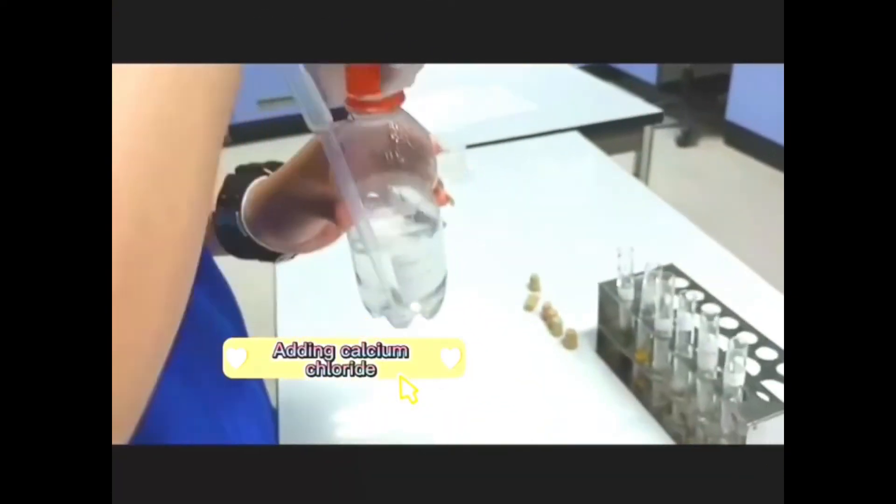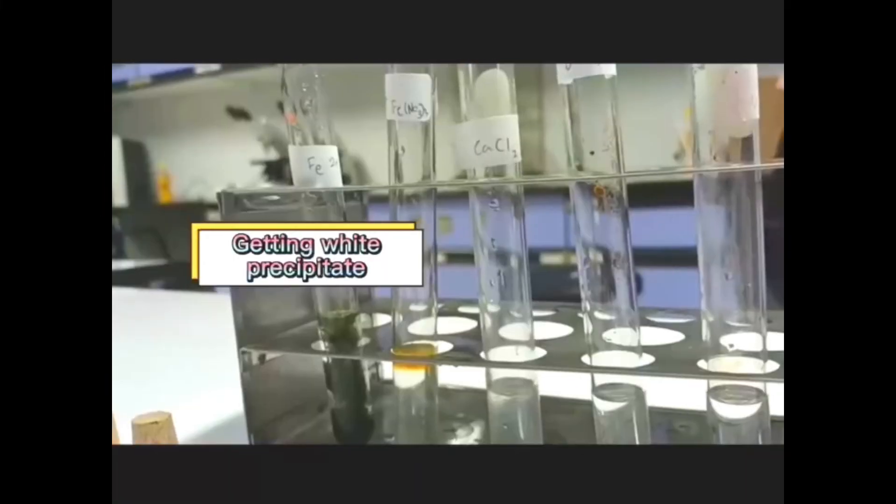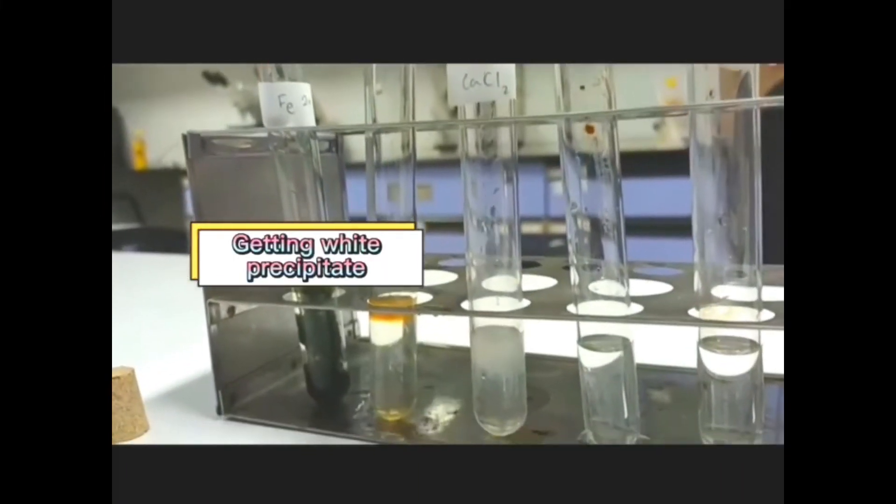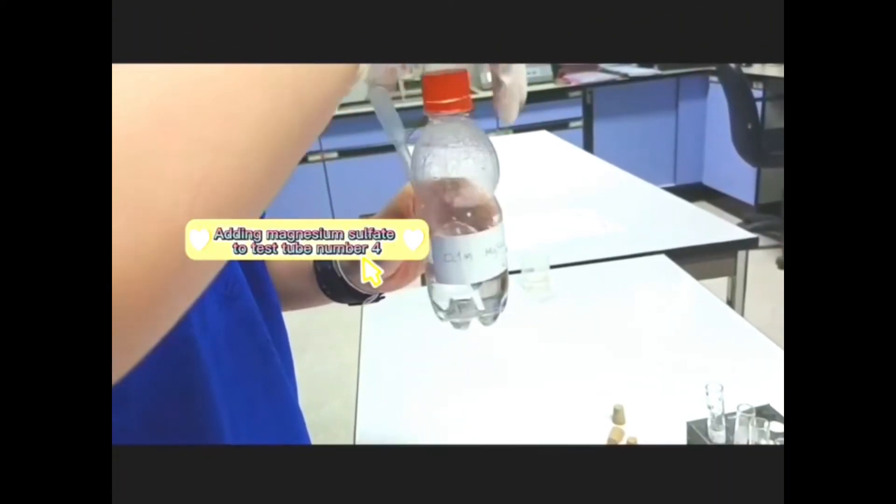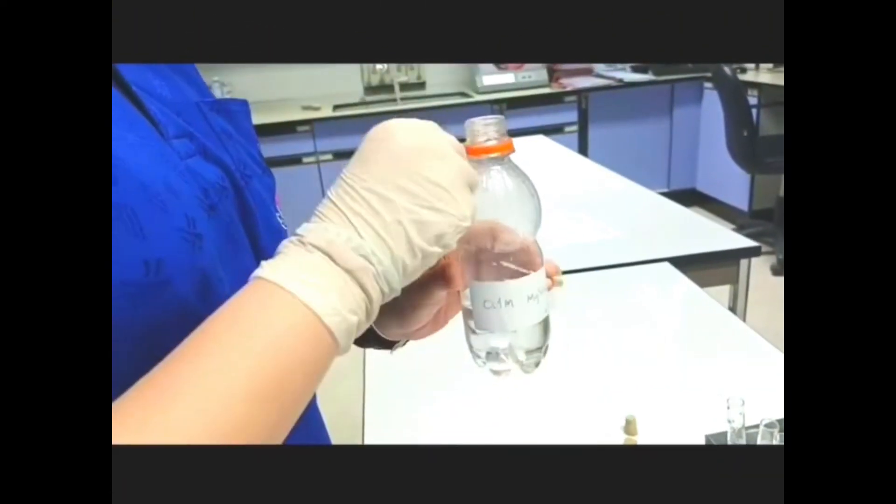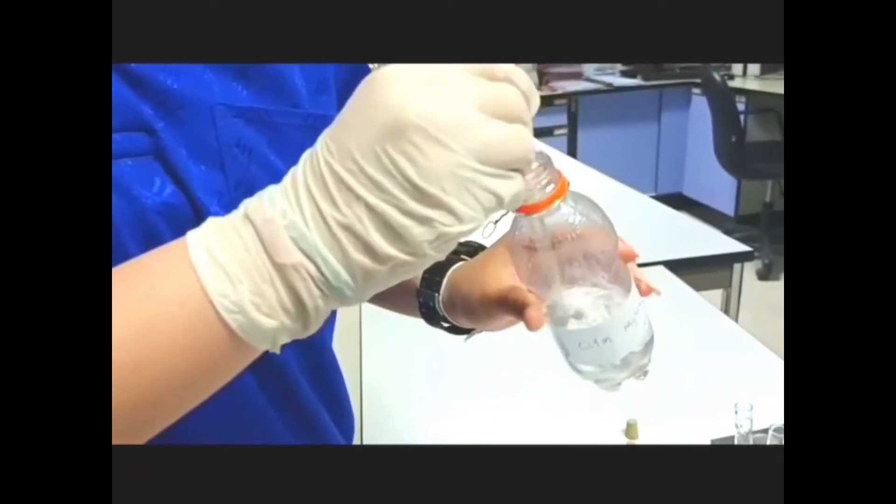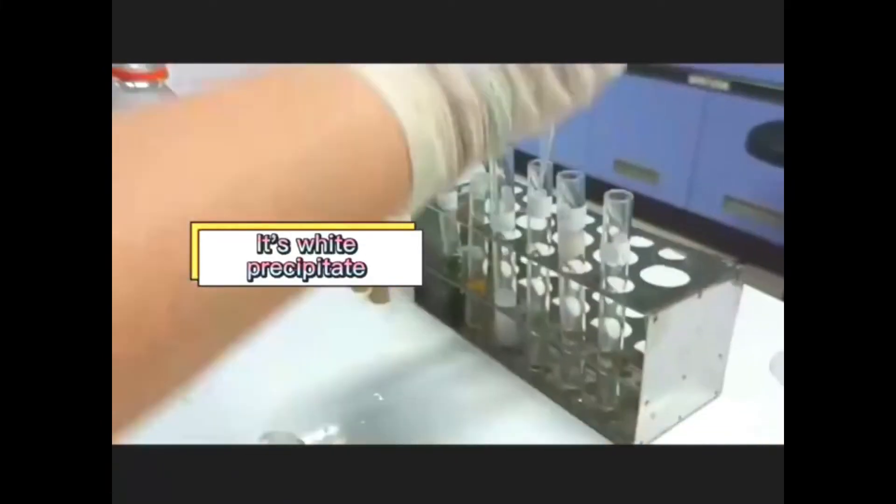Then, adding calcium chloride to get white precipitate. Adding magnesium sulfate to the test tube, we will get white precipitate.